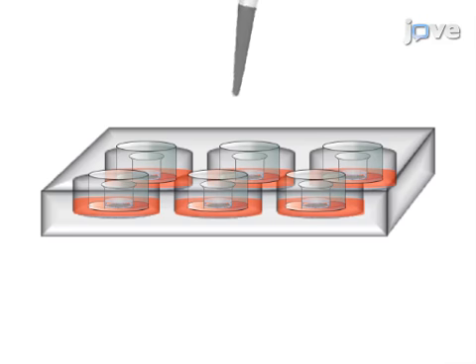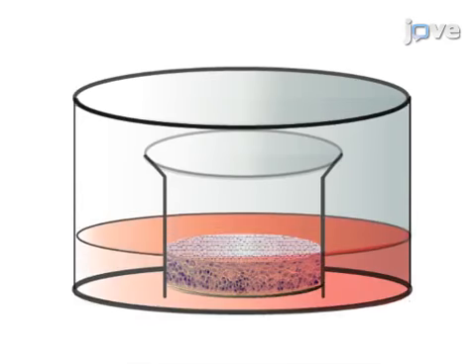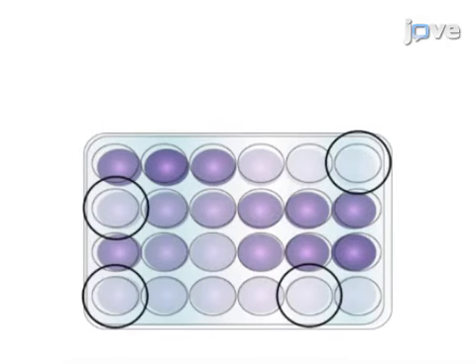The following day, the tissues are hydrated, followed by the topical application of the positive and negative controls and the test chemicals of interest onto the surfaces of the tissues in duplicate. After a fixed period of exposure, test chemicals are removed by washing. The tissues are post-incubated in fresh assay medium, and the toxicity of the chemicals is then evaluated by MTT assay.